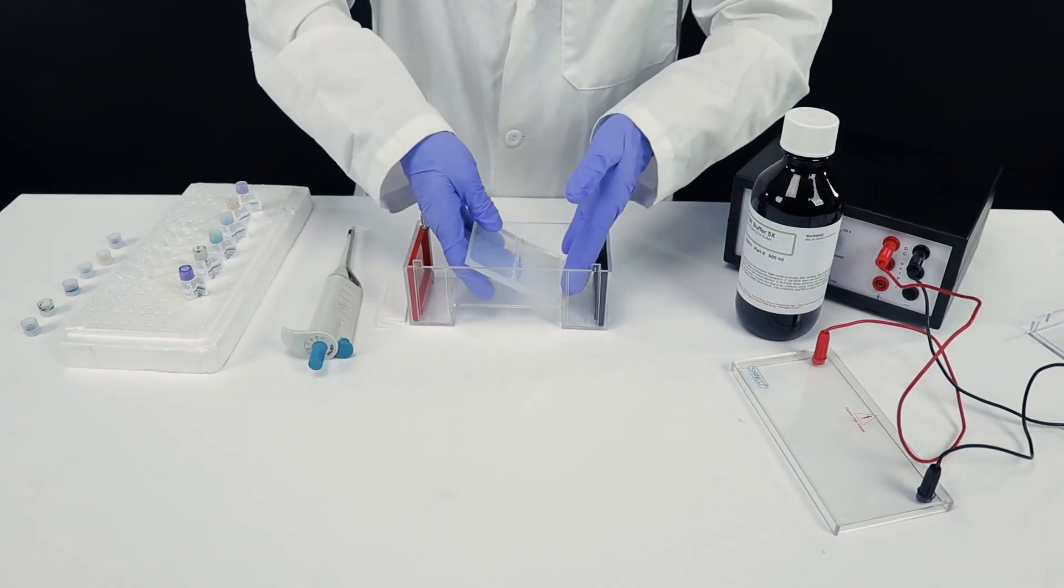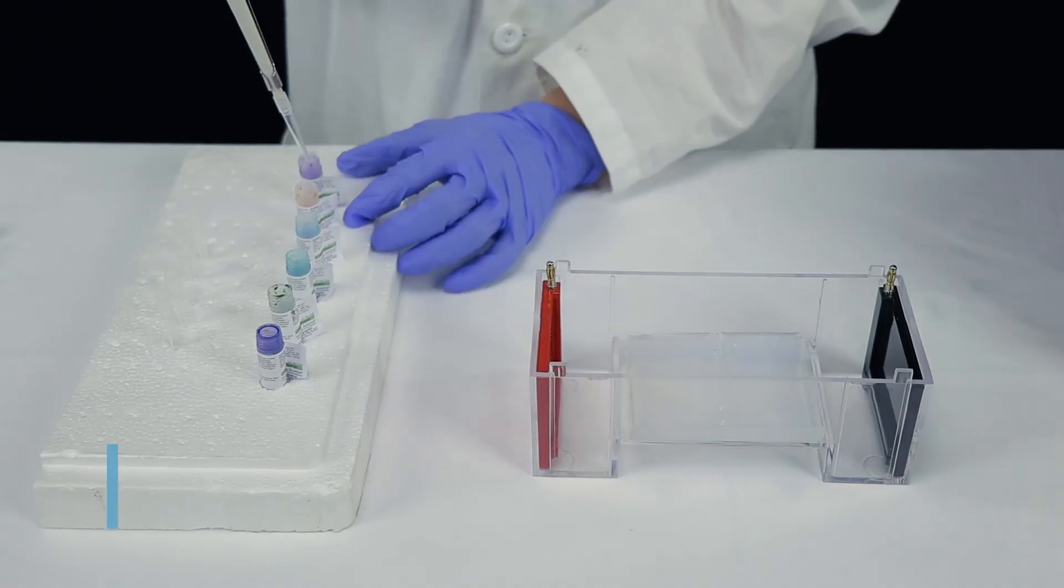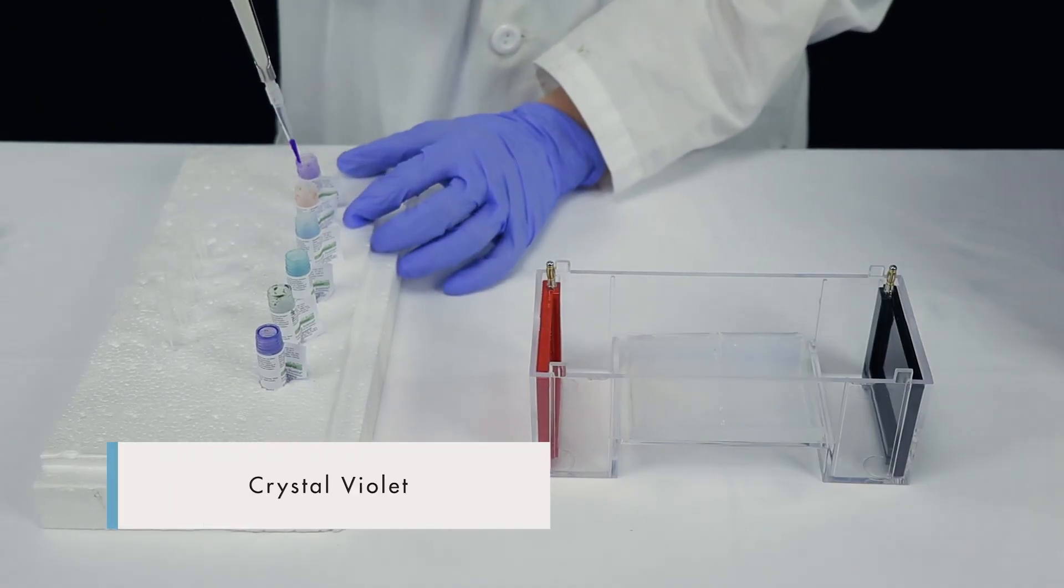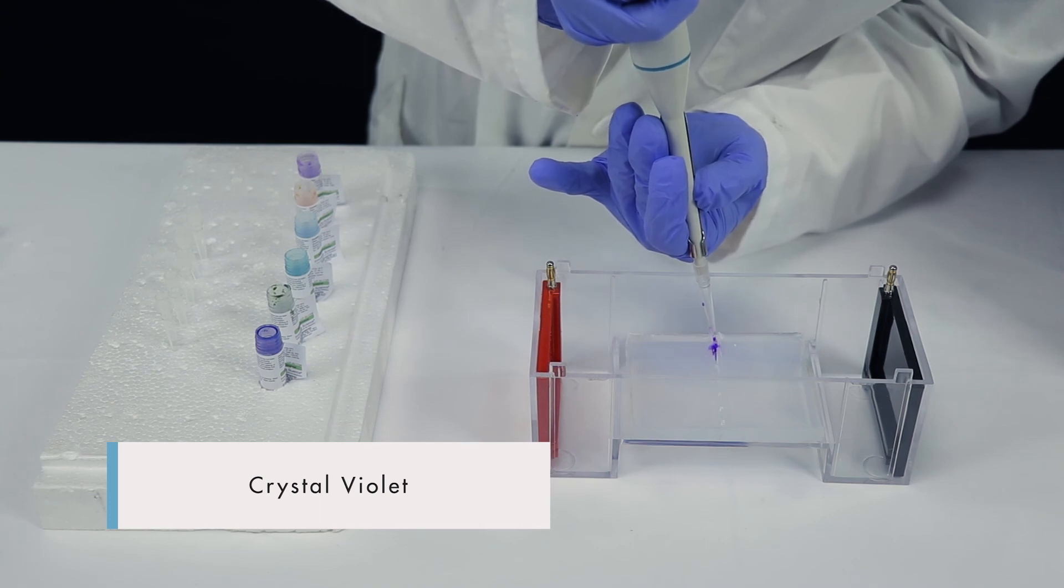First, place the prepared gel into the tank. Then, use a micropipette to fill each well with a separate dye. Be sure to change the tip for each dye.